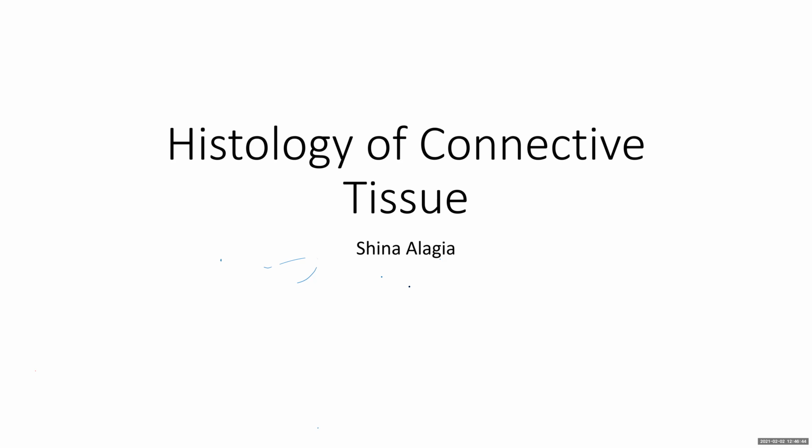Hello class, so let's look at the connective tissue images and go from there. You have already viewed the introduction to connective tissue. A quick refresher: connective tissue connects, binds, and is the most diversified tissue within the human body. There are varieties of cells. Here is something else to look at.